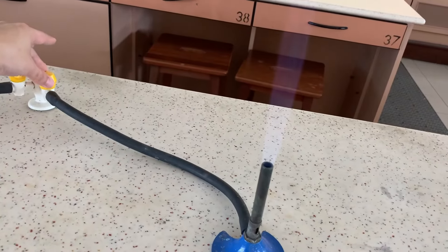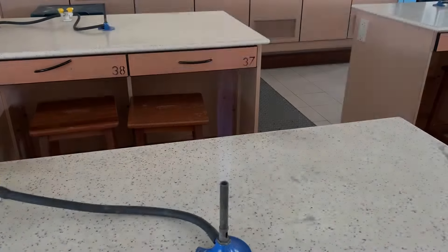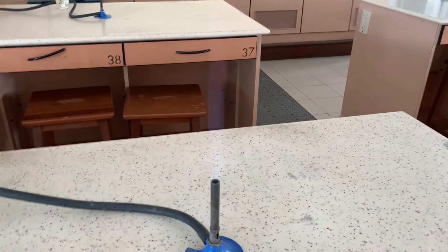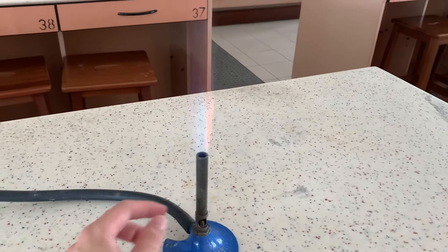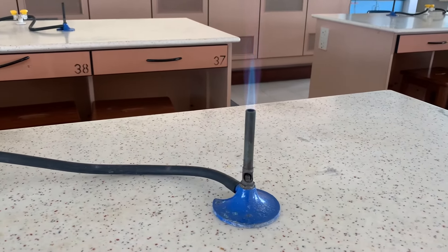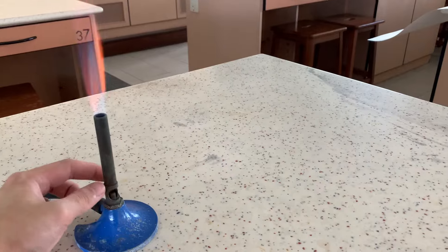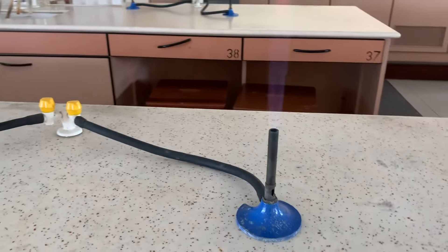To turn off the Bunsen burner, we simply turn the knob on the gas tab. By opening the air hole, we allow more air to mix with the gas before combustion, so the flame burns hotter. For general heating, it is recommended that you keep the air hole half open and use a non-luminous flame.